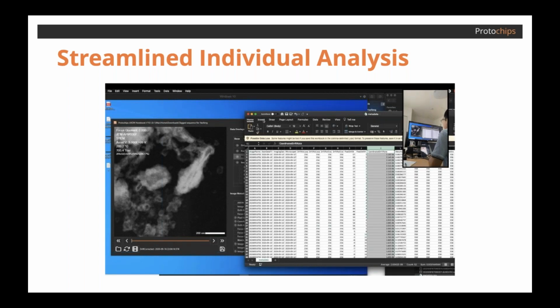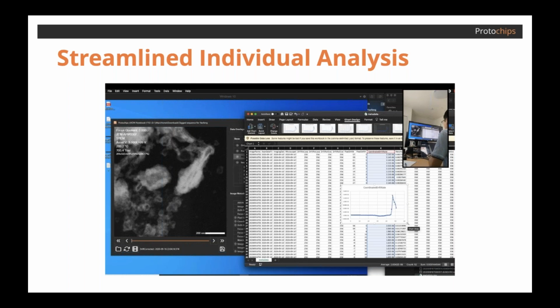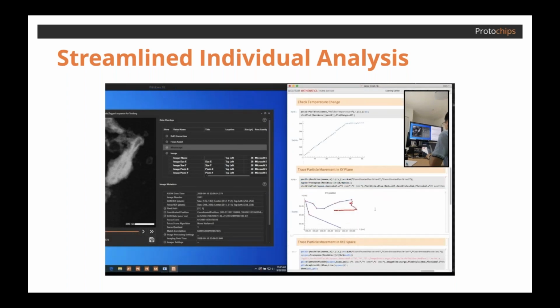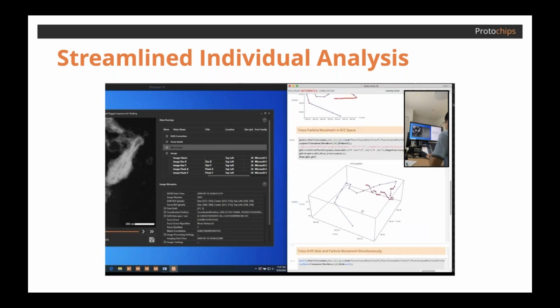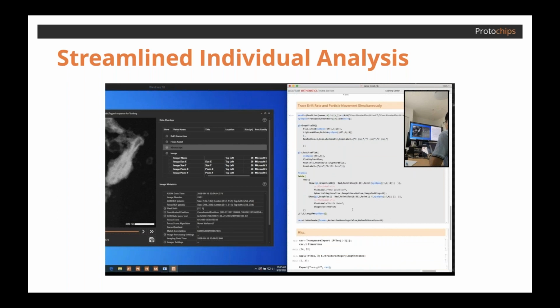The CSV file containing all TEM and in situ parameters that comes with the export allows you to manipulate the data within Excel for graphical analyses, trend analyses. You can filter, create pivot tables, etc. But you can also use that CSV to generate more advanced graphical representations of metadata to make trend spotting easier for you and convey information more clearly.